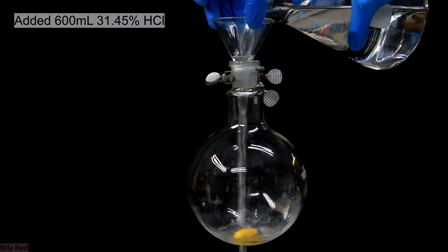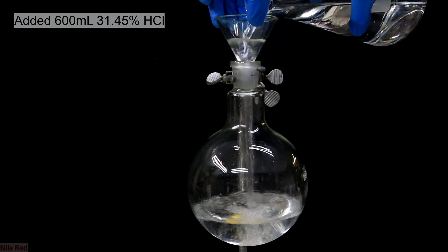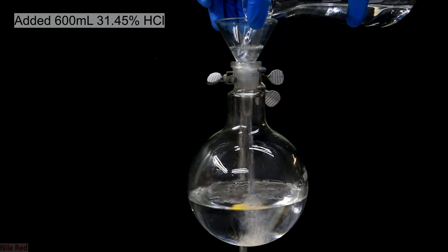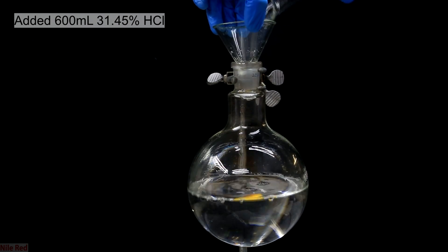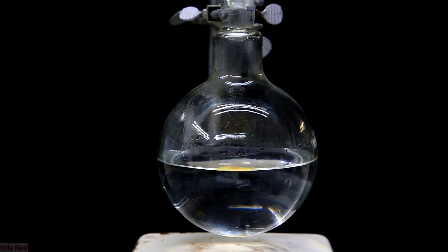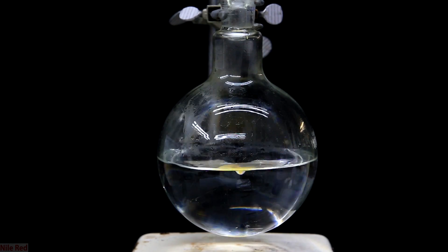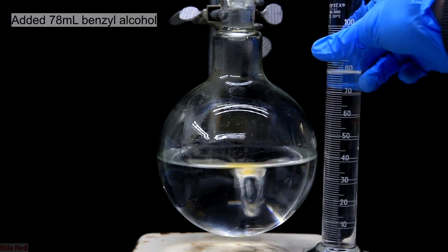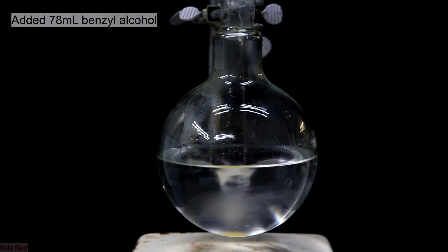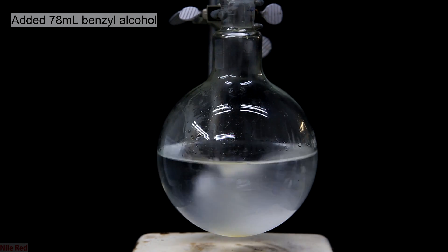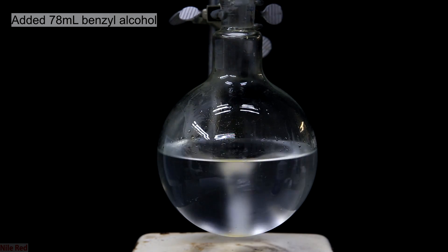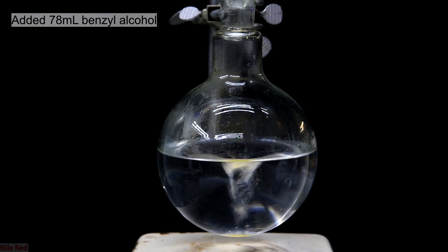I started off by adding 600 milliliters of 31.45% hydrochloric acid to a 1 liter round bottom flask. I then turned on some super strong stirring. With very strong stirring I poured in 78 milliliters of benzyl alcohol. Just for safety purposes the addition should be done relatively slowly.